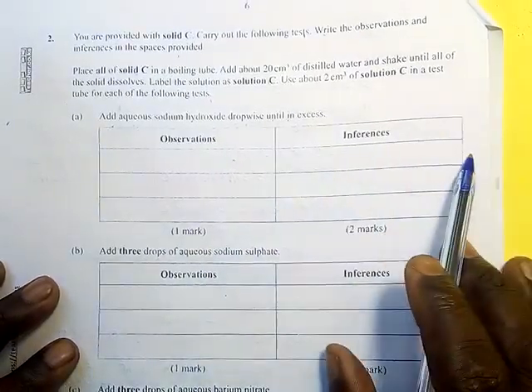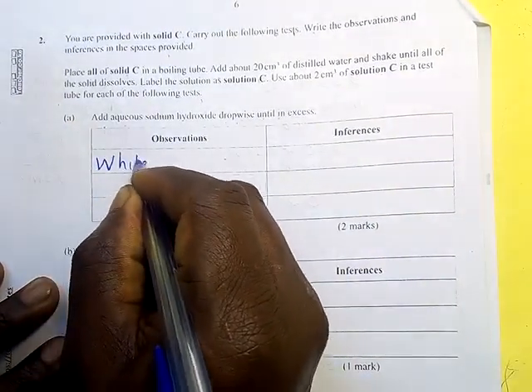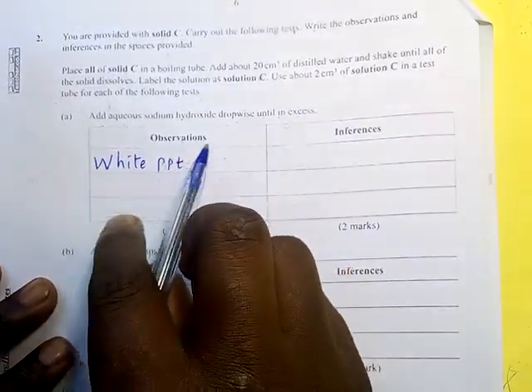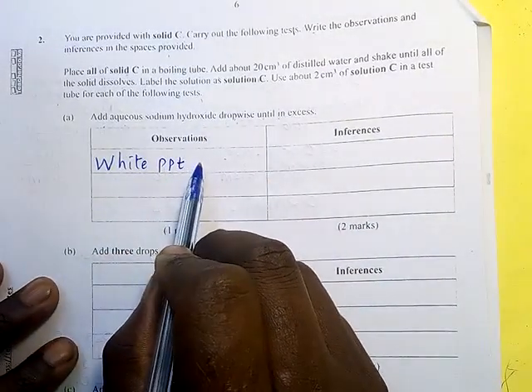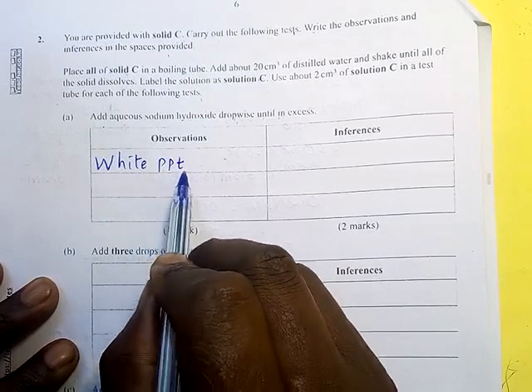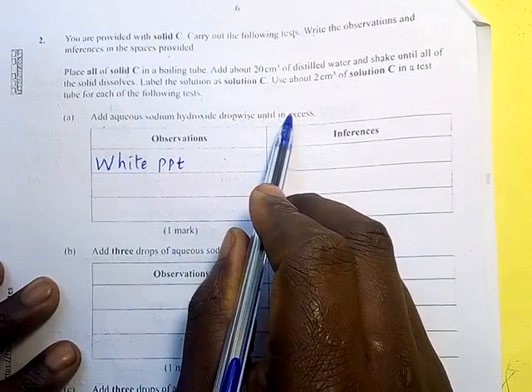So this is what was observed. White PPT. So this is the first observation. When you put a drop, a white PPT is formed. Then what happens to the white precipitate when sodium hydroxide is added in excess?